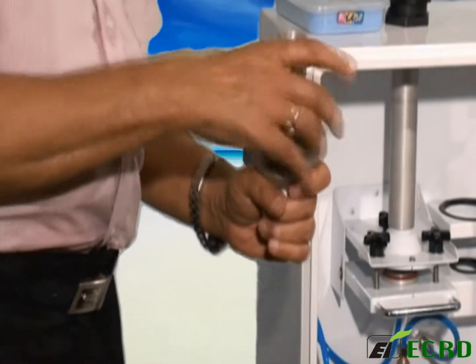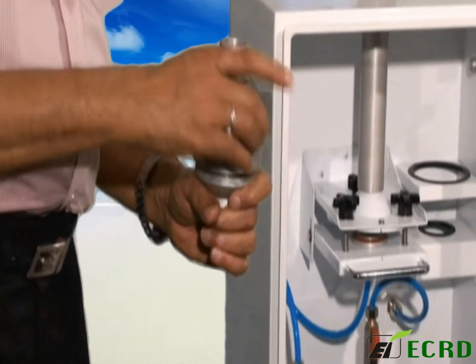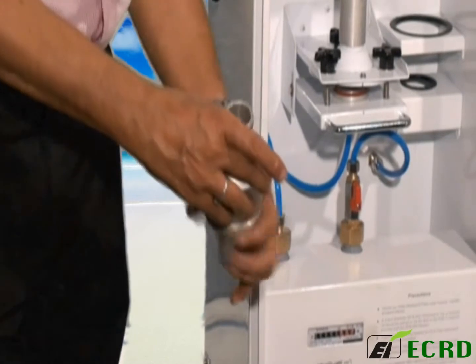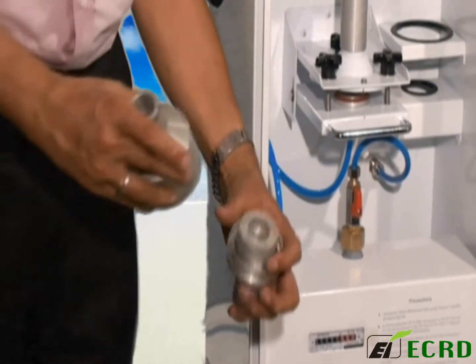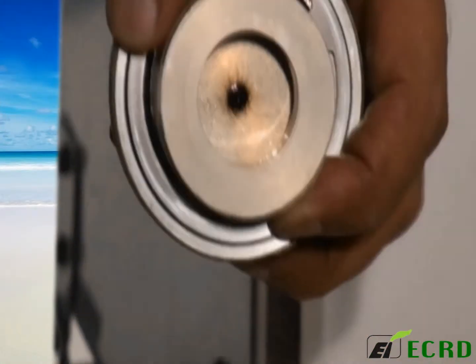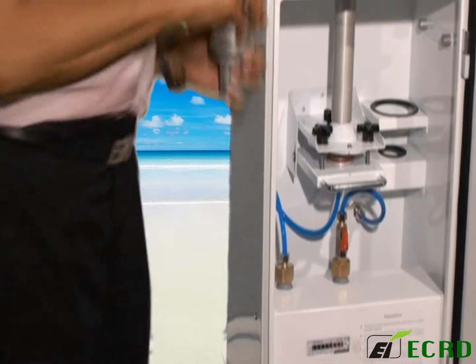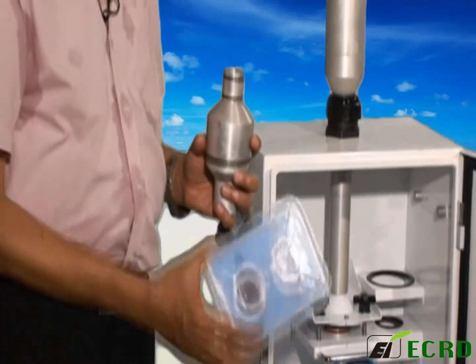As you can see here, the winds impactor had a good amount of dust inside it. Unscrewing it reveals the black deposit inside. That is the coarse section, and this one is the fine PM2.5 dust.